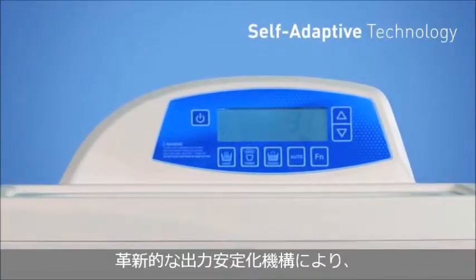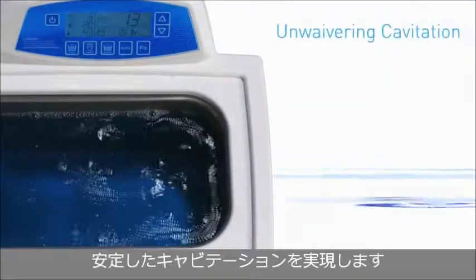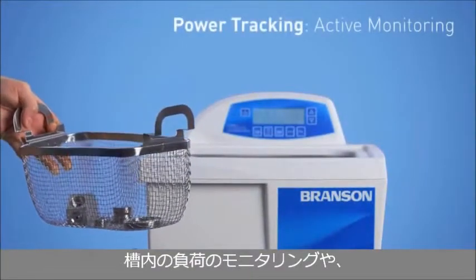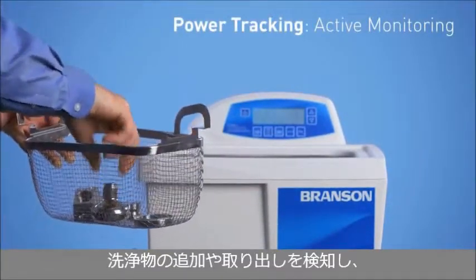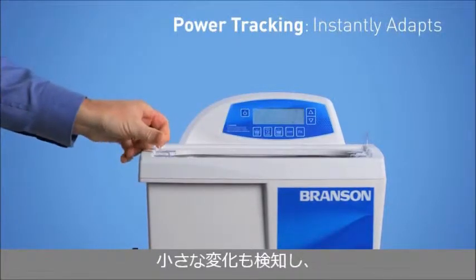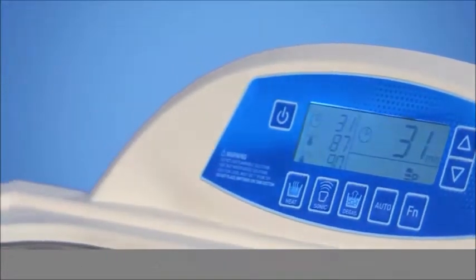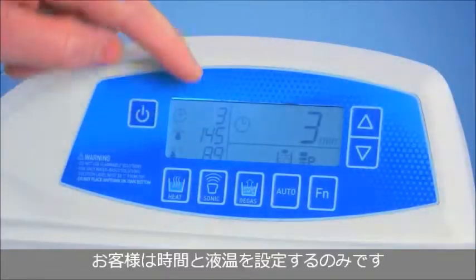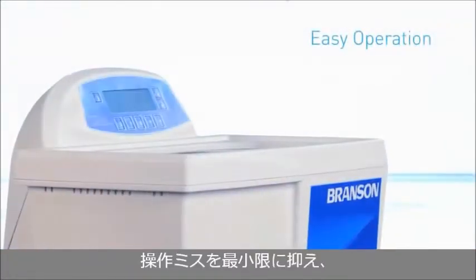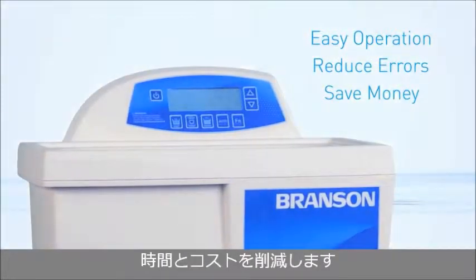With our new and innovative self-adaptive technology, you'll get unwavering cavitation and calibration when load conditions change. The self-adaptive uses ultrasonic power tracking to actively monitor the bath load and detect the adding or removal of items. Once a small change is sensed, the power tracking circuitry technology will bring the operating frequency back to its optimum levels. All you have to do is adjust the time and temperature, if needed. It's hassle-free operation, with the lowest margin of error to help you save time, money, and peace of mind.